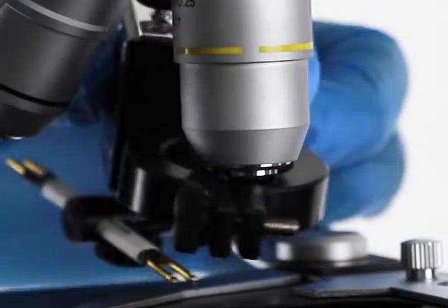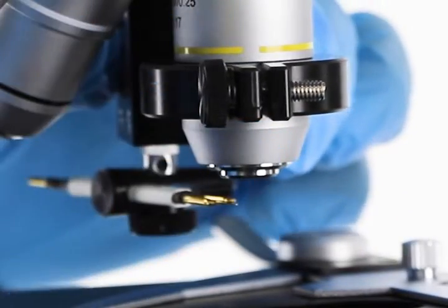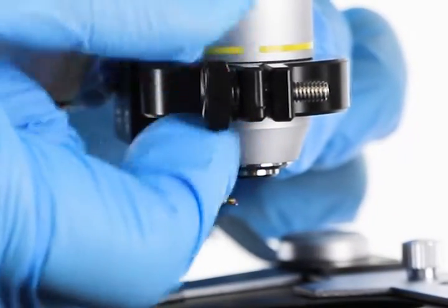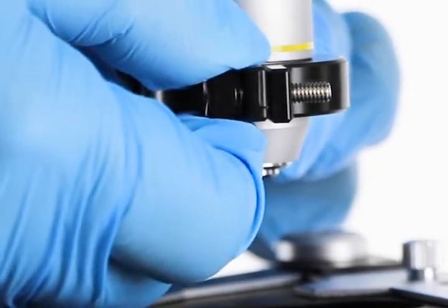Lower the stage all the way and mount the filament holder on the objective. To do this, slide the objective ring clamp of the filament holder over the 10x objective and tighten the thumb screw to secure it.